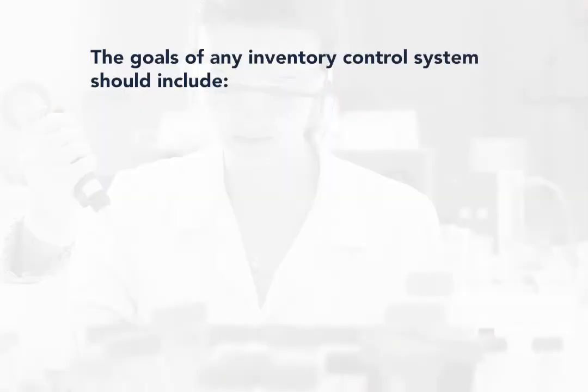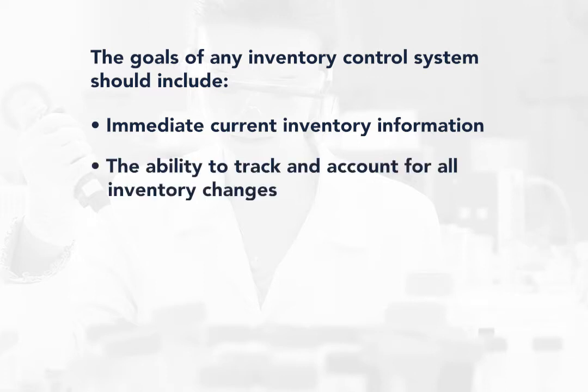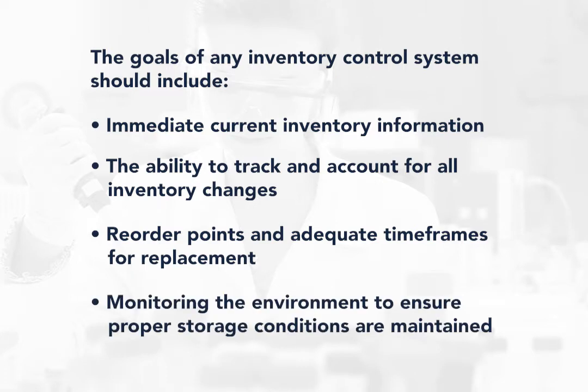The goals of any inventory control system should include always having immediate information about your current inventory, having the ability to track and account for all inventory changes, having adequate reordering points and realistic timeframes for replacement, and finally to have a system in place to monitor the environment to ensure proper storage conditions are maintained.